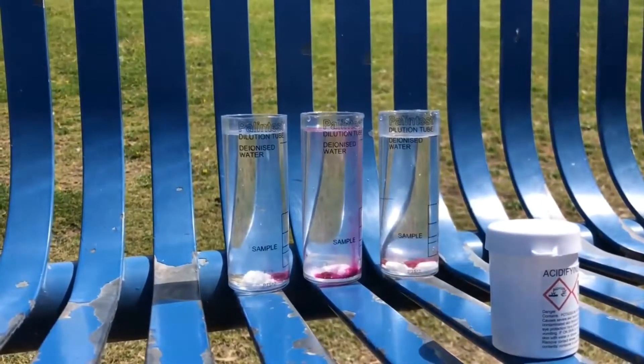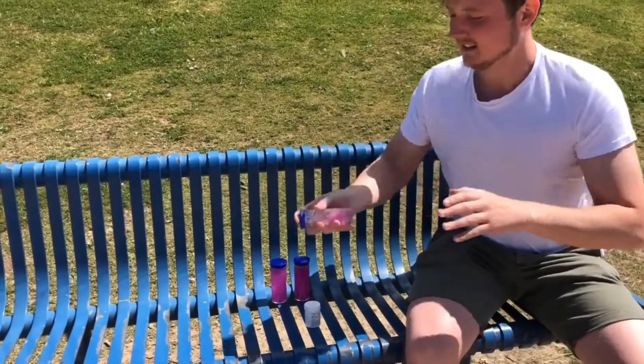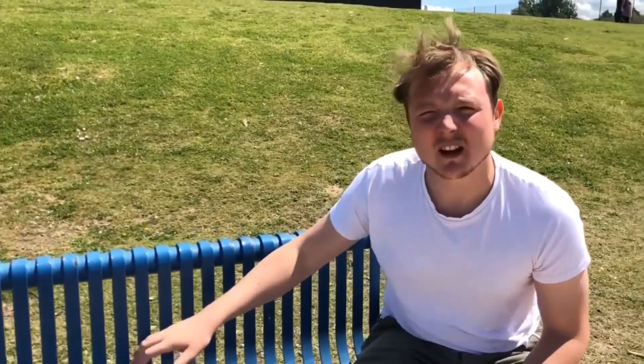They are already starting to go a little bit pink. Now that that's done, all we have to do is wait half an hour.